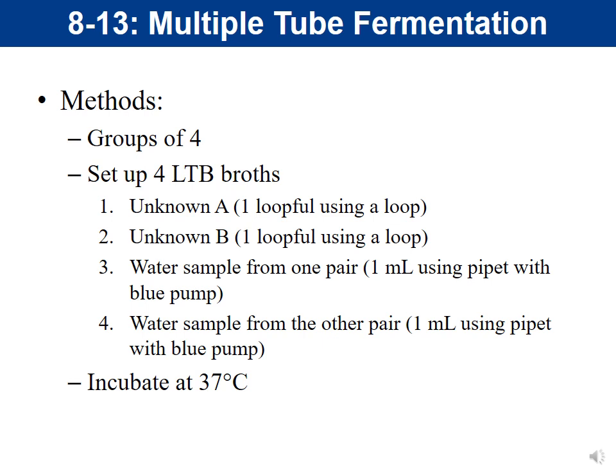Now remember that the endo agar and the membrane filter technique is done in pairs. So each pair has their own water sample. So in a group of 4, you would have 2 water samples that you're testing. One pair would test one and the other pair would test another.